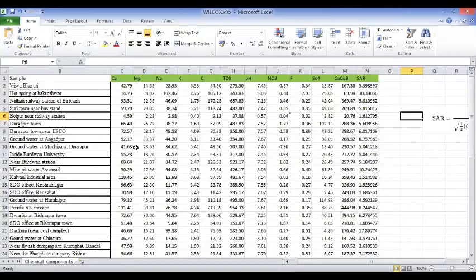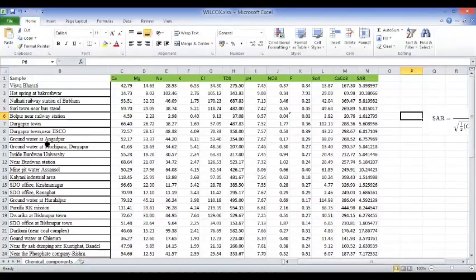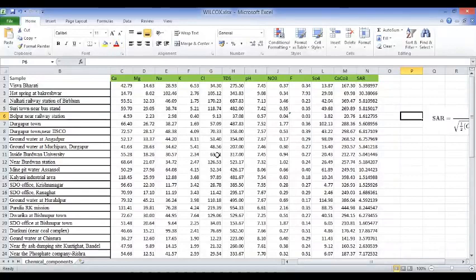Now you have some chemical and physical parameters of water from various sample stations. To find the first parameters, we need to find out the Wilcox diagram or the Piper diagram. We do this to understand the nature of the water — whether it is suitable for irrigation or for drinking purposes.